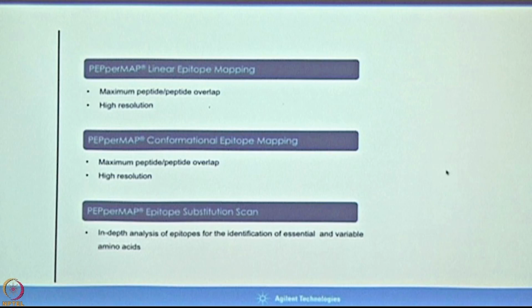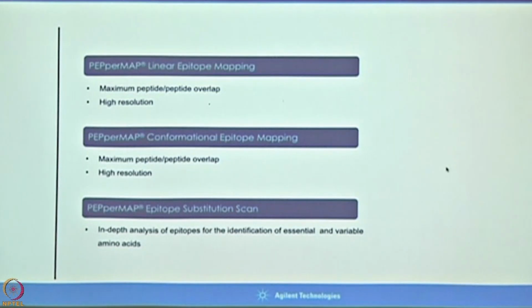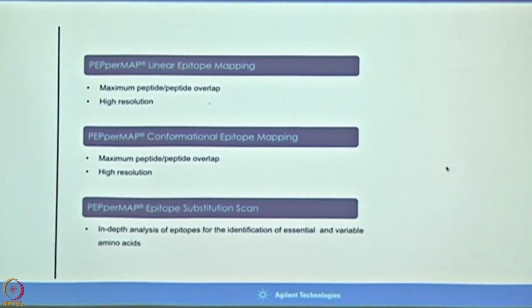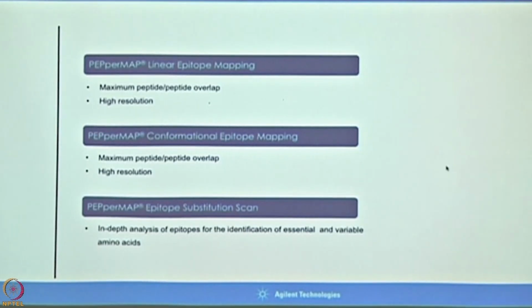So let's start with the antibody analysis. Antibody analysis means if you're making any antibodies to use, right? You have to know whether this is going to bind to the right epitope or not. Really important. Otherwise, you cannot make the monoclonal antibody. You cannot make any polyclonal antibody, and it has to be very specific to the target, right?